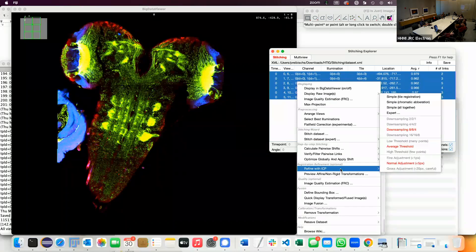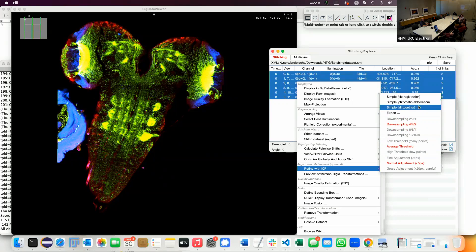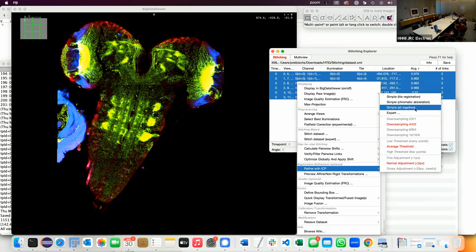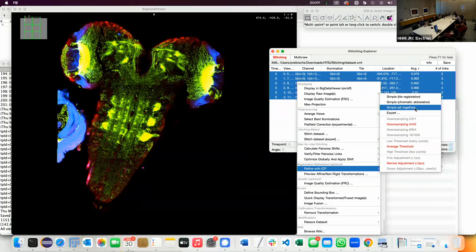What you can then do is refine the whole alignment using interest points. This is our attempt at doing this as user-friendly as possible with almost zero input. It usually means several steps: finding interest points, finding the right parameters. Here we try to do this automatically — basically select at which level you want to find interest points. You can do all tiles, chromatic aberration correction, or all together. If you do tile registration it won't move channels relative to each other. If you do chromatic aberration it will only move channels relative to each other. If you have no bleed-through between channels, there's no point in moving channels. So tile registration is the choice here.